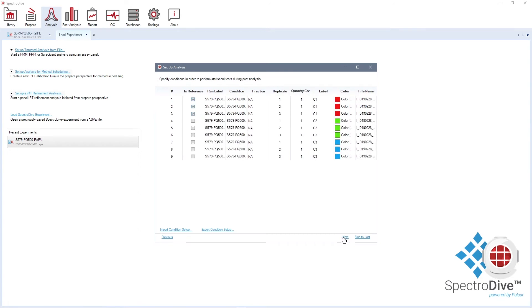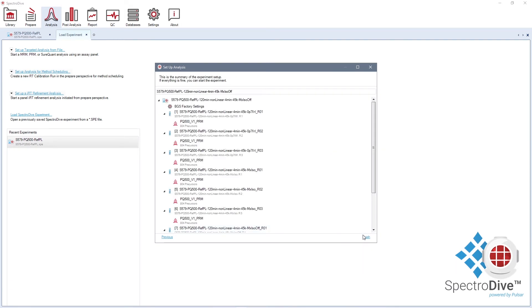In the last step, you can define the experimental conditions for differential abundance testing. Click Finish to start your analysis.